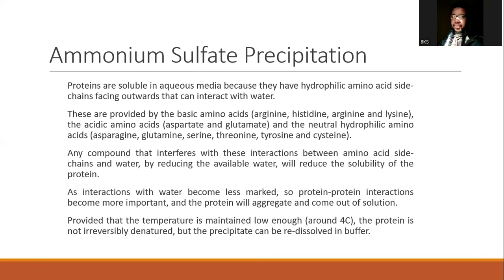Because of this, these proteins are able to interact with the surrounding polar environment inside the water, being soluble inside the water. That is what is preventing them from precipitating out. But remember, in the hydrophobic amino acids, when you have a protein in the folded form, the hydrophobic amino acids in most cases are not positioned on the surface. They are embedded inside the protein, so they don't interact with the surrounding aqueous environment. So now, how do you precipitate the protein out?